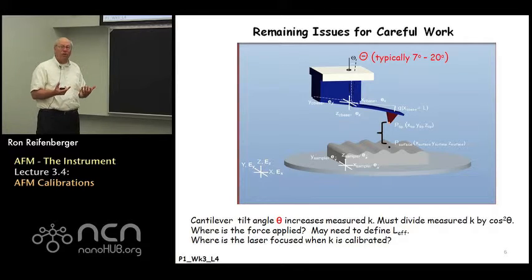You also have to ask the question, where is the force being applied to the cantilever? Force is, of course, applied to the tip that's mounted on the cantilever. The tip is never at the end of the cantilever, so just knowing the length of the cantilever doesn't necessarily tell you where the force is applied.